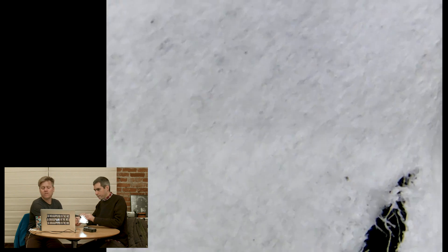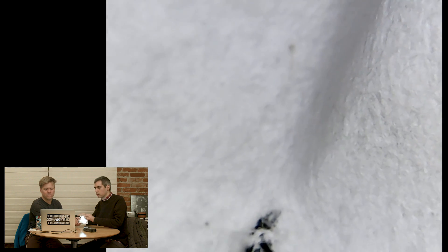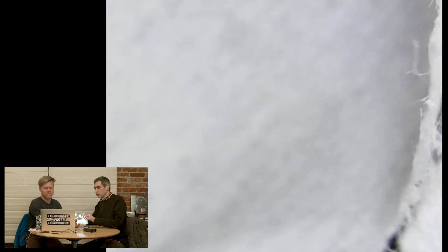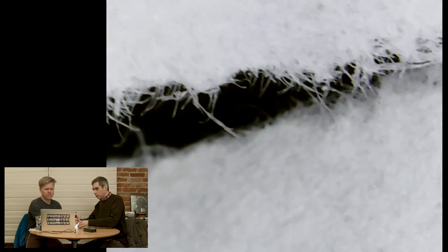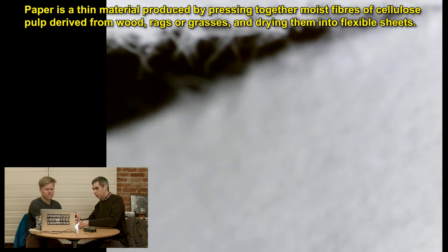Can we just see what this paper looks like when you tear it? Wait, let me get this spot. Ready? Give it some slack — go up more so you can see this. Do it. Look at that. Ooh, that's kind of cool. That is neat. Wow, look at the fibers of the paper. Look at these fibers. Come on over here. Bye, Brent.